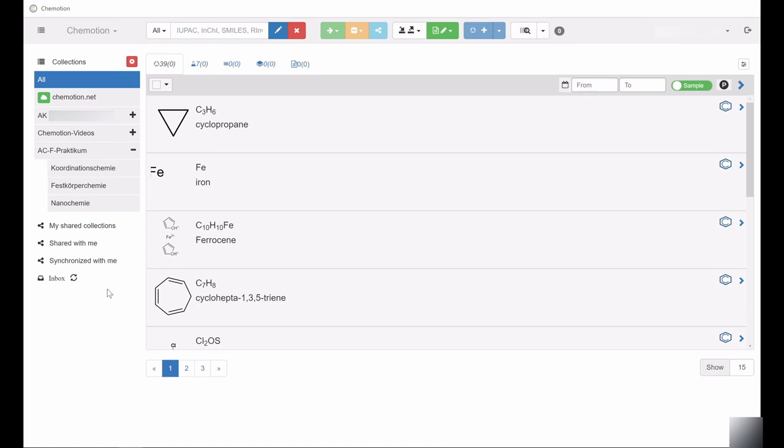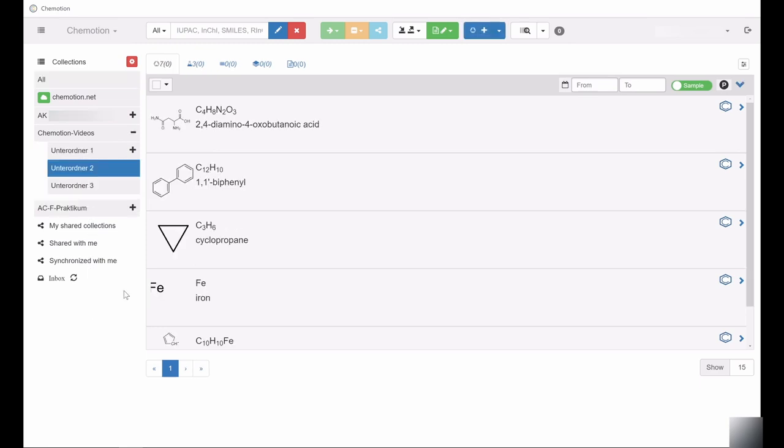If you intend to edit or delete entries, this should take place within the specific collection to which the entry was originally assigned, as opposed to the All collection.